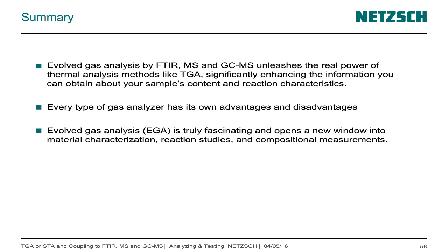When I started with this thermal desorber, I took around 1 to 5% of the gas flow on the thermal desorber and a small amount of sample. And I used old columns from the analytical people who threw them away, and it was good enough for me in the beginning.